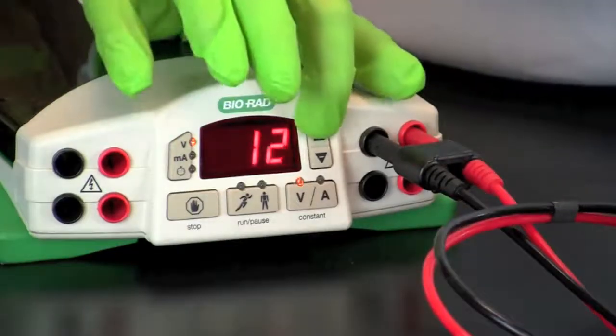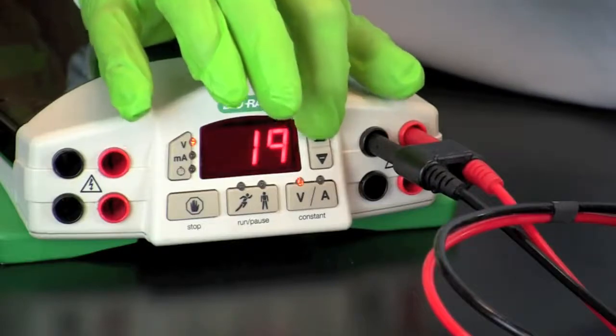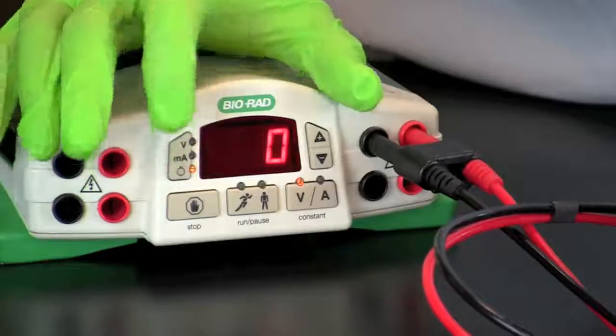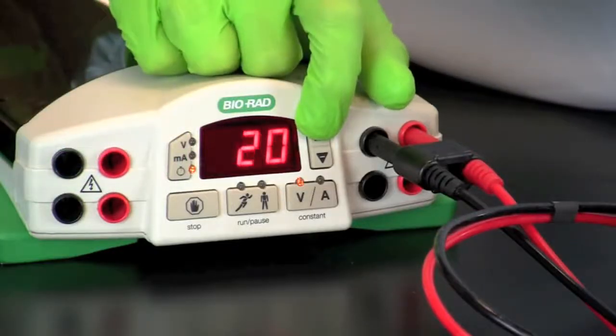Turn on the power supply and run the blot at 20 volts. If a timer is available, set it for two and a half hours.